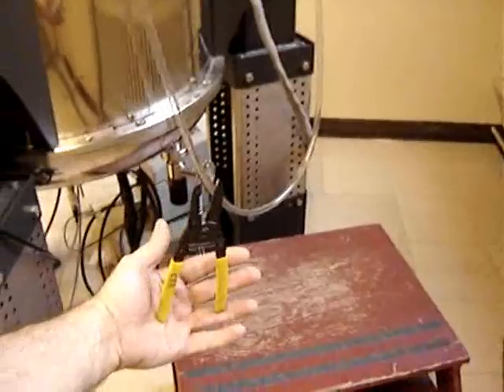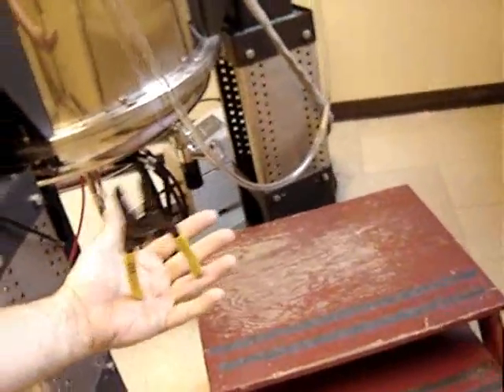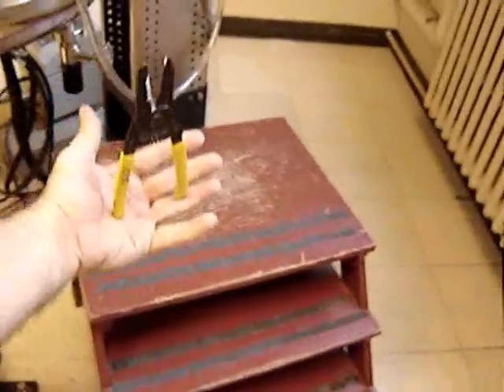Let's see what else we can do with superconducting magnets. It's attracting the tool, but it's also strongly aligning it. There we go — standing up. It's following the lines of force. I don't want to get real close; it'll yank it in.